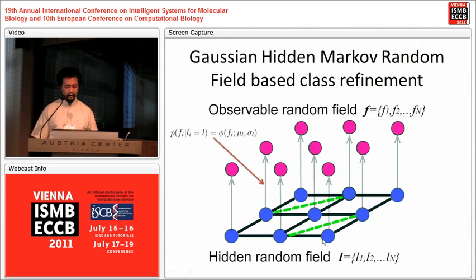And in our implementation, we consider 2 types of neighborhood relationships. The first type is the standard neighborhood defined on the voxel grid of the tomogram, and the second neighborhood relationship is defined on the rotation invariant feature space obtained using the large-scale clustering.